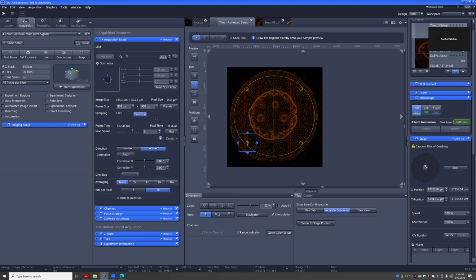Right, so your total image will have more pixels, but the actual physical resolution, so what you can resolve, will remain the same. Because the resolution is really determined by how much, if I have 2 pixels next to each other, can these 2 pixels distinguish a structure, right? How fine is that on, say, a 10x?